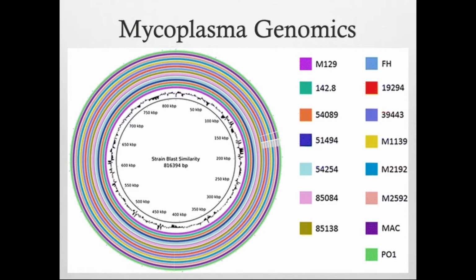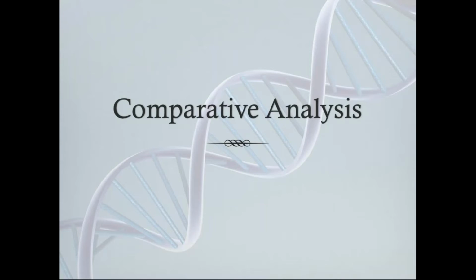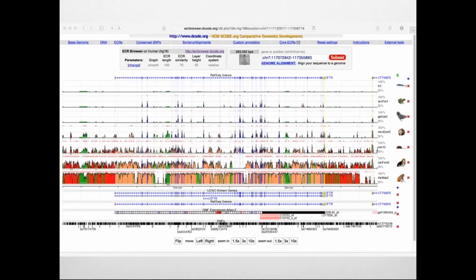And so this is a study that was done with Mycoplasma, which is a small bacteria, and we derived the sequence, working with a group at UAB, of a little over a dozen different bacterial isolates, and then this just shows them all compared to each other. Other views of this will show the particular variants that are present in some of these strains of Mycoplasma, and you look to see again if they're associated with disease.